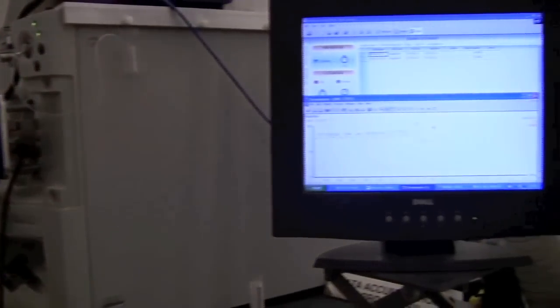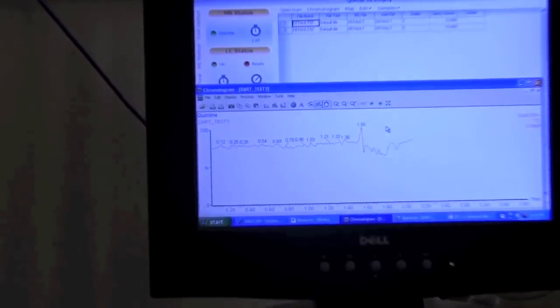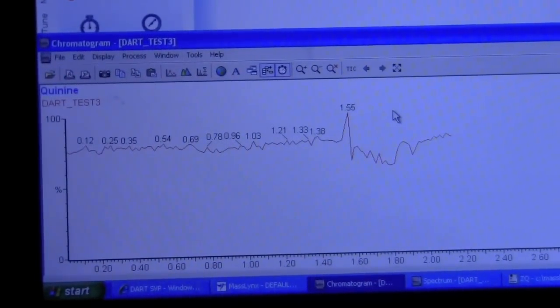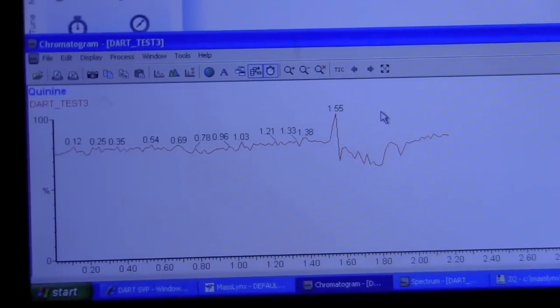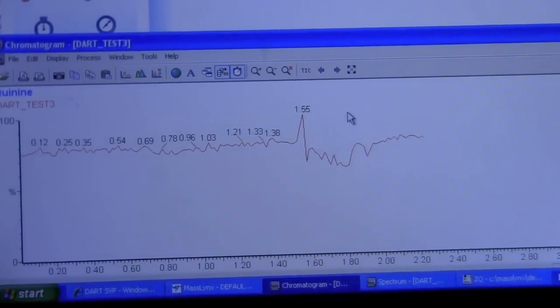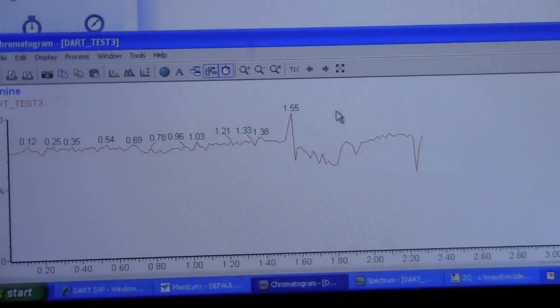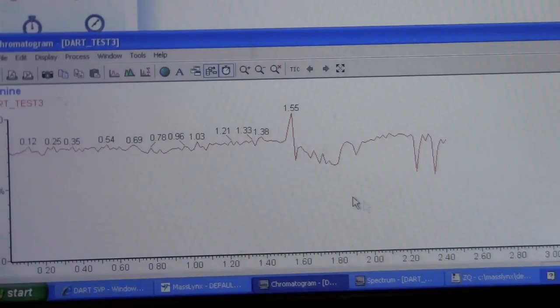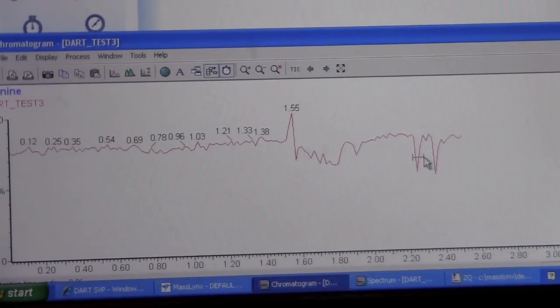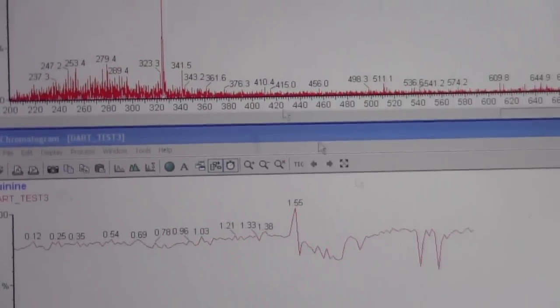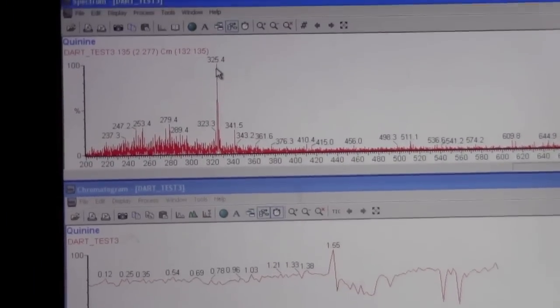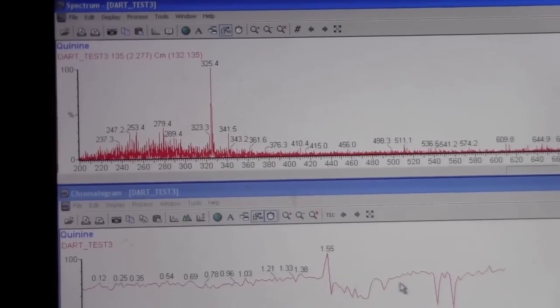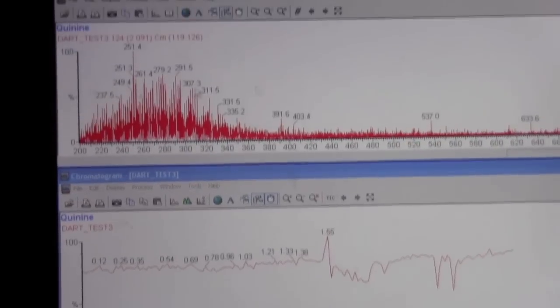Now if we go back to the chromatogram over here we may see as we put the sample into the source that the ion count goes down. This is normal. This is because our capillary is blocking some of the stream of the ions, and those are typically the areas we want to observe our mass. So if we right click and drag on the dip we should be able to see the mass spectrum, and this is the mass of the sample that we put in here. If we click another region we will just get noise.